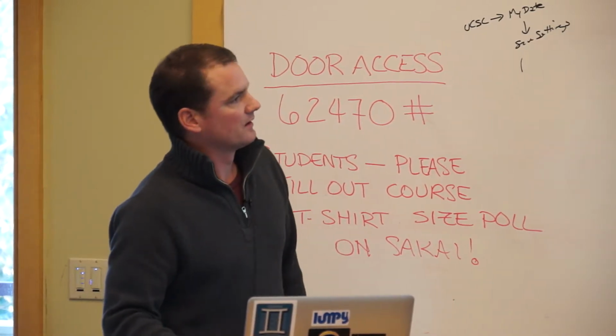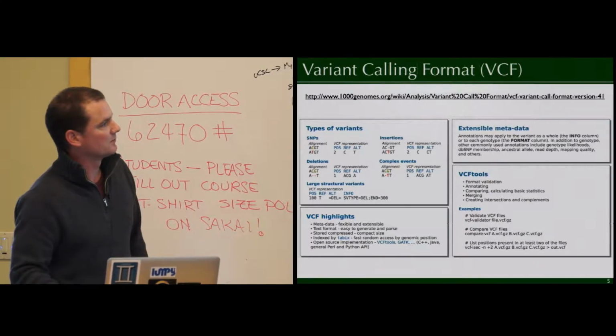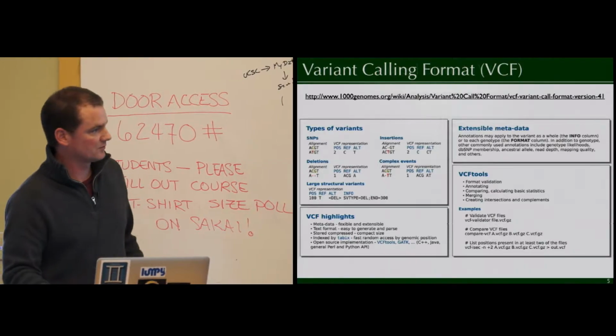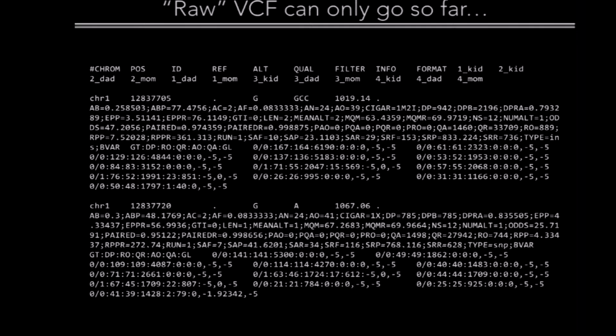This is just some slides from the 1000 Genomes Project that describe some more details about the VCF format and some other tools such as VCFtools, which we're not going to talk about, but I wanted to include this slide so that you can go back to it later and maybe use VCFtools and other methods for filtering VCF files.